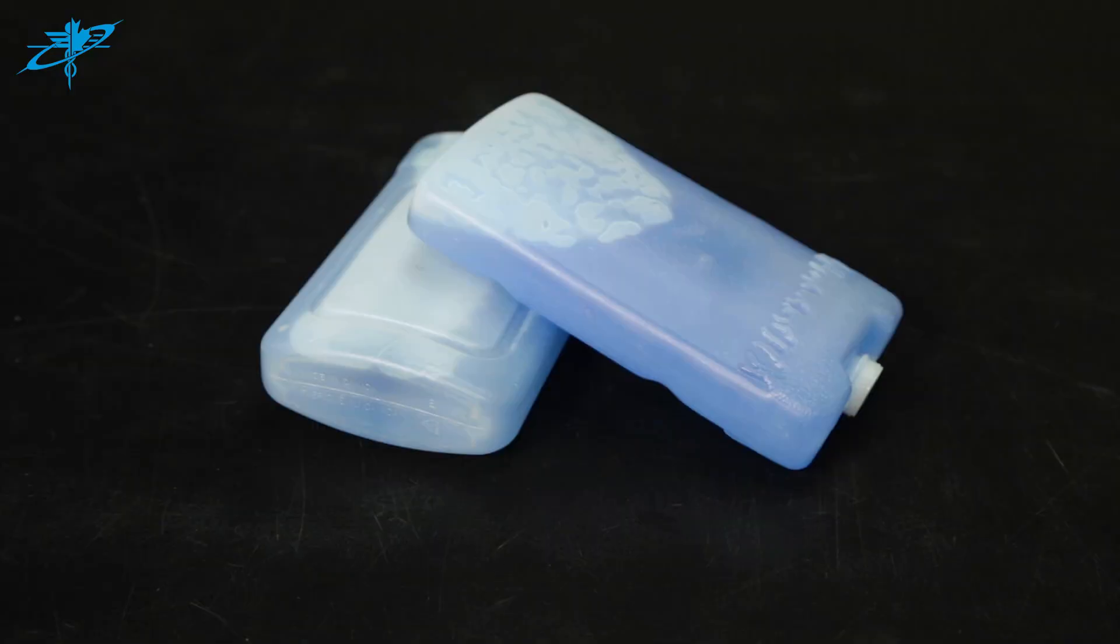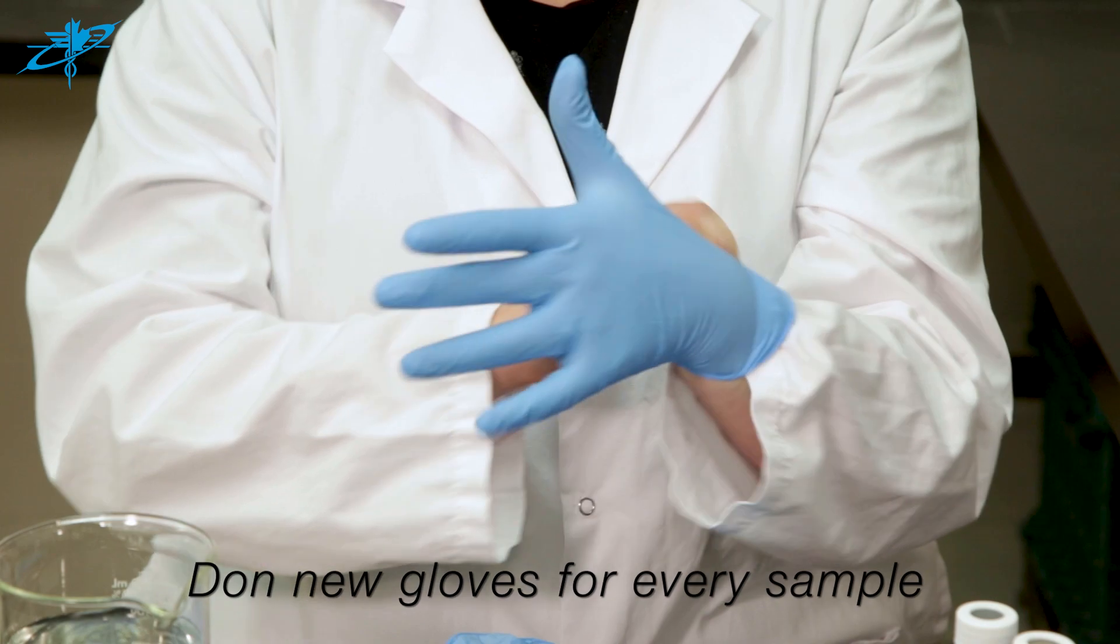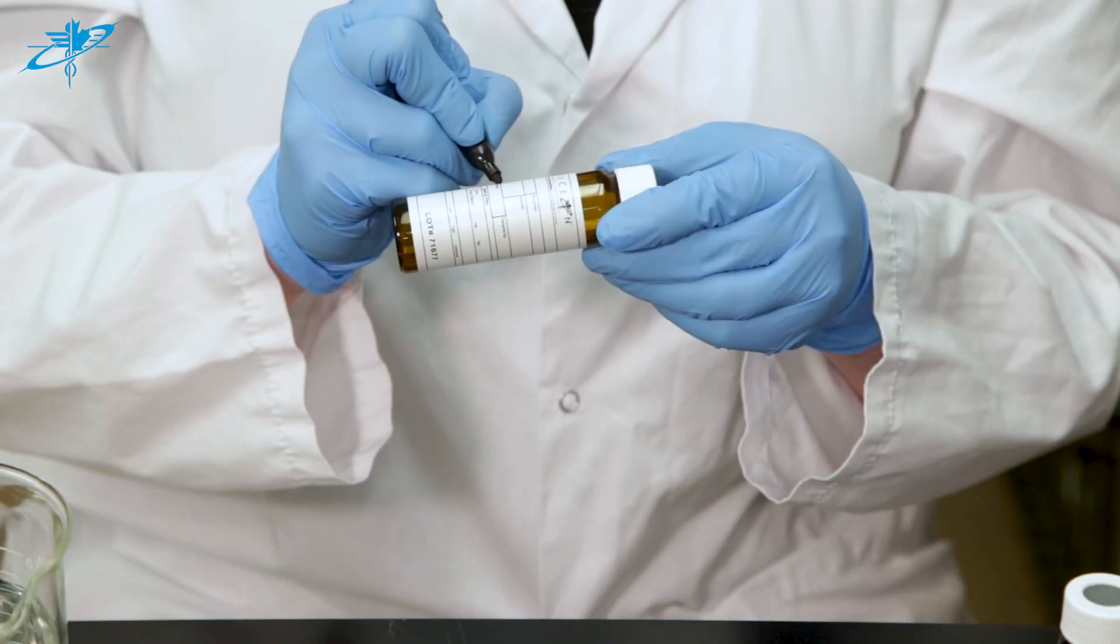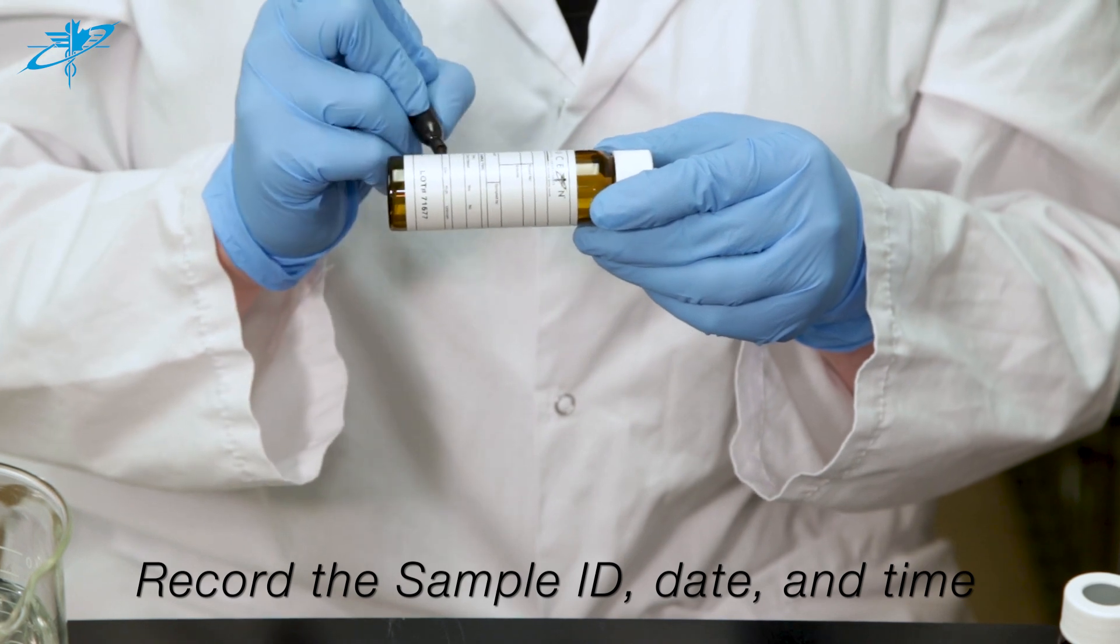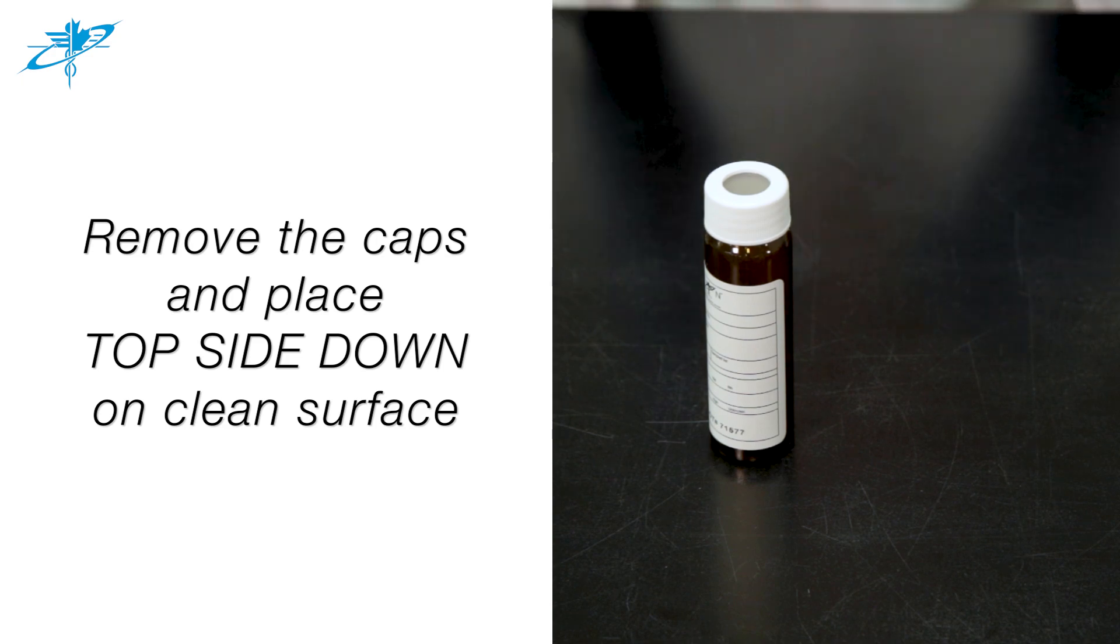Don a new pair of gloves for every sample. Record the sample ID, sampling date, and time on each vial label. Remove the caps from the vials and place them topside down on a clean surface, ensuring you do not touch the inside of the cap or threads.